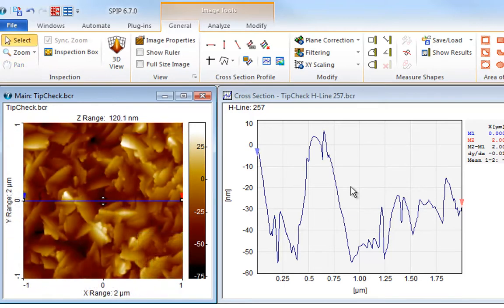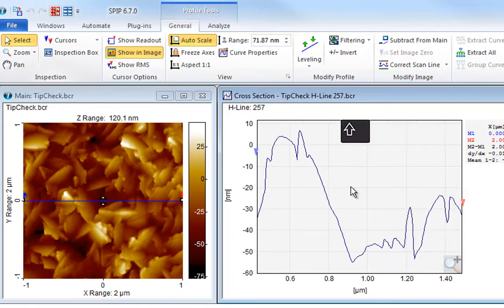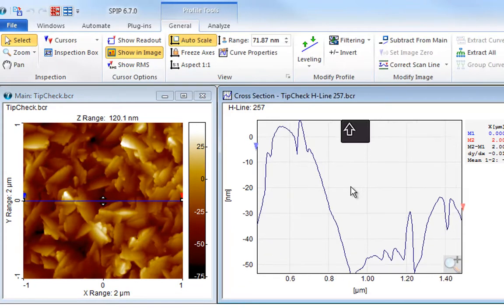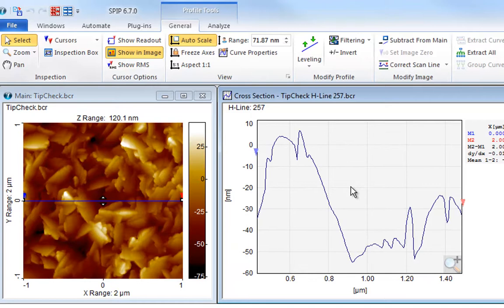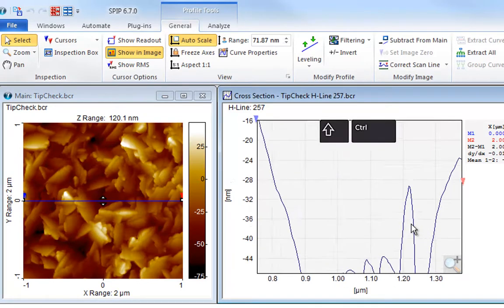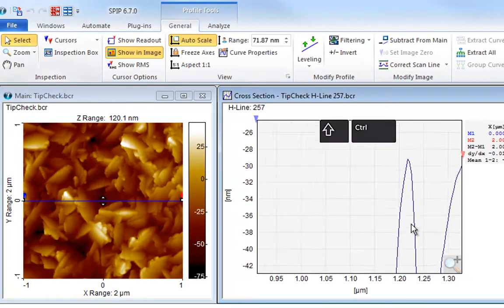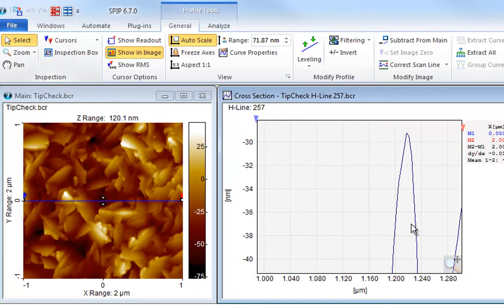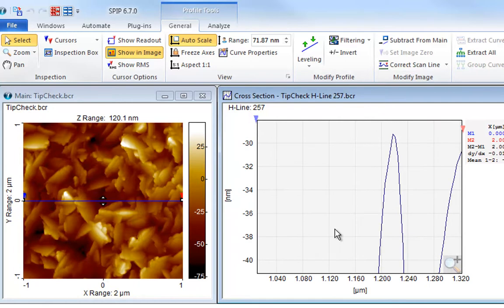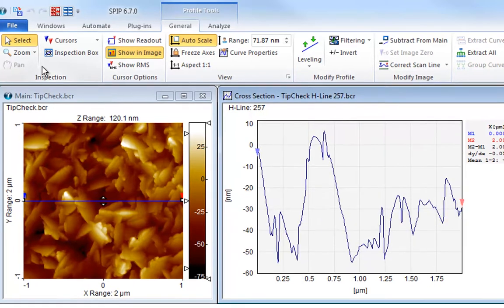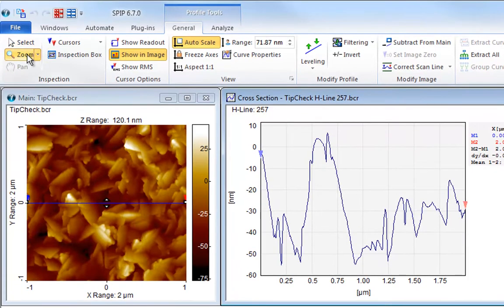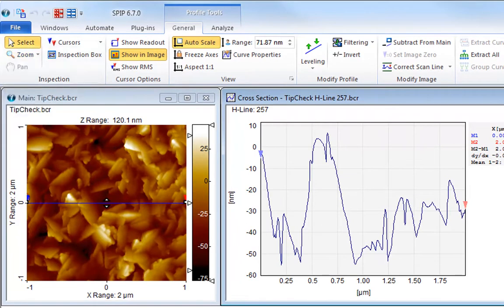In curve windows hold down the shift key while scrolling the mouse wheel, and the window will zoom in the vertical direction. If both the shift and the control keys are pressed, zooming is performed in both the horizontal and the vertical direction. The zooming can be reset by hitting the home button on the keyboard, or by clicking the zoom to 100% button in the ribbon.